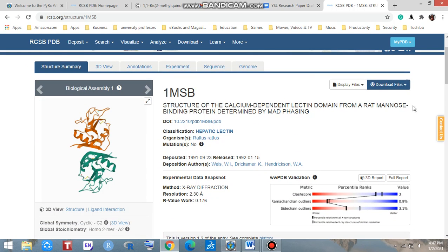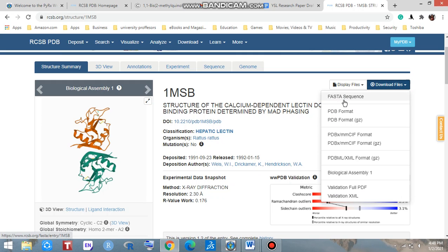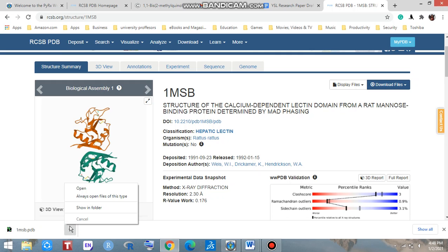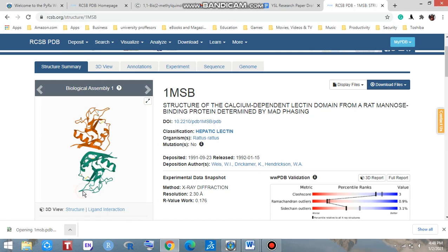Now, how can I download this protein? Just click here on 'Download Files'. You can get the FASTA sequence and PDB format. We are going to download through the PDB format. The download is complete.